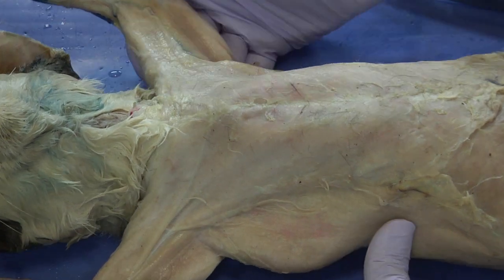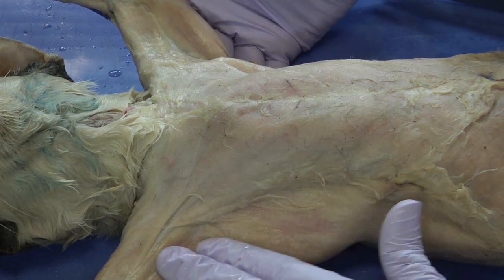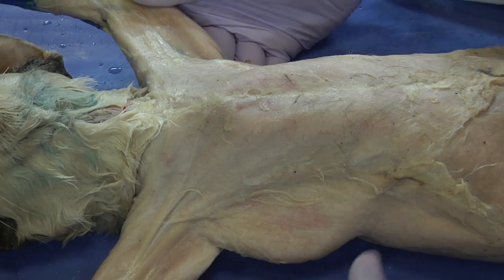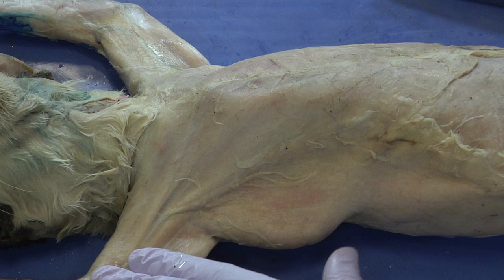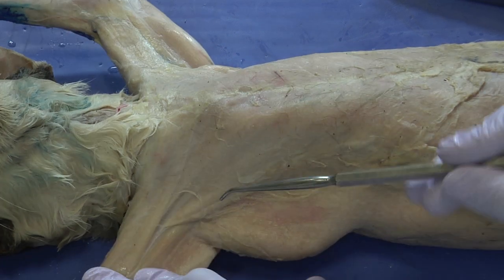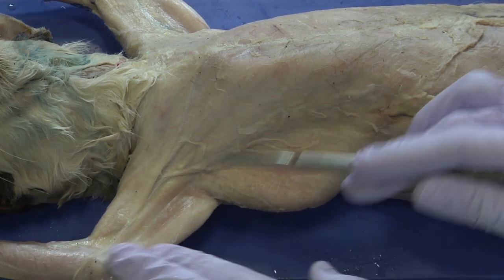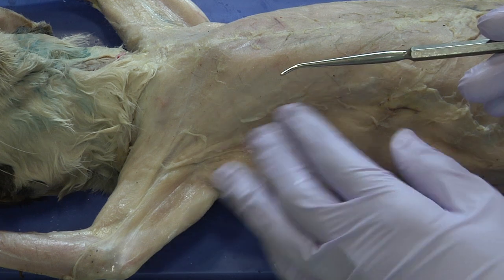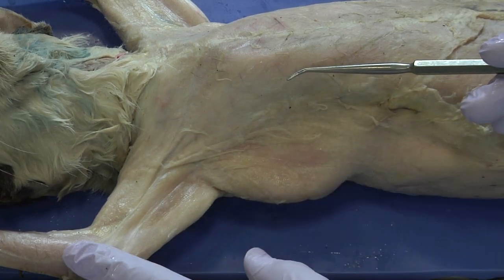Now that the cat's chest is pretty much clean — the upper chest and upper arms are clean of connective tissue — you can begin to see the muscle pattern and how it's striped. That was the level of removal we wanted to have with our connective tissue.